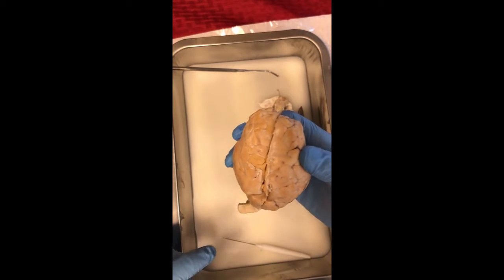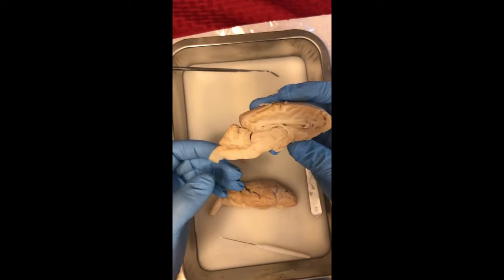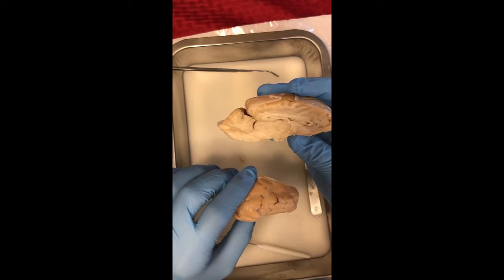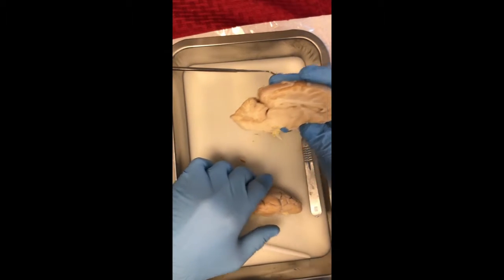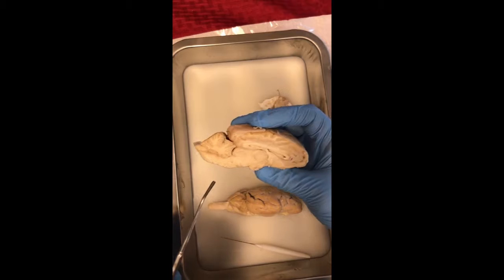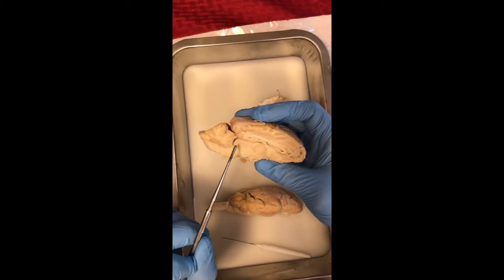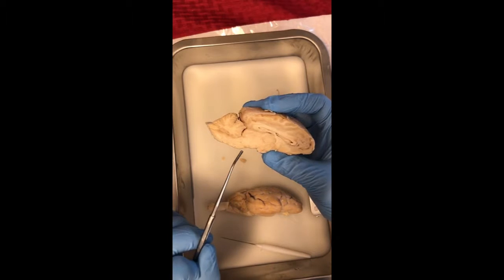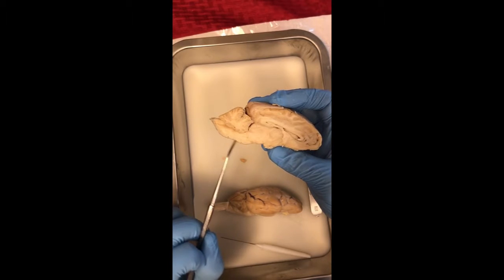Next is the brain stem, and the brain stem runs all the way from here out through the spinal cord. So then the midbrain. The midbrain is comprised mostly of the cerebral peduncle. So the cerebral peduncle is located here in this area. The superior and inferior colliculus are located here and here. The pons is located in this area, and then the medulla oblongata is right here.